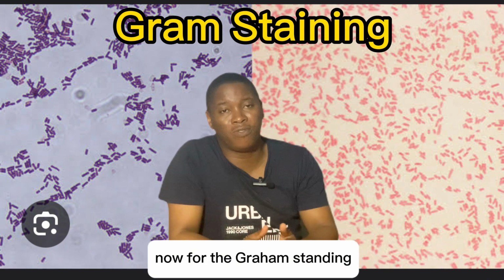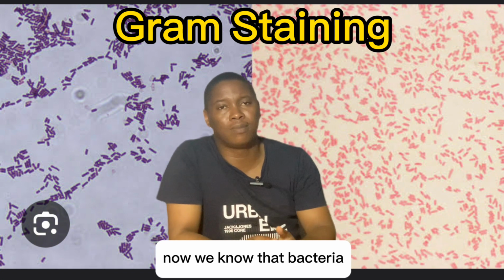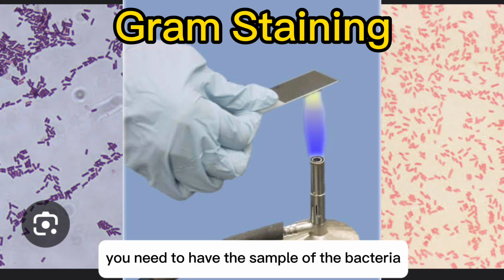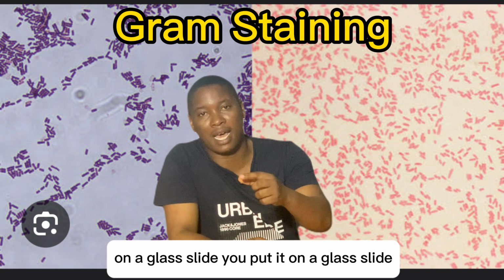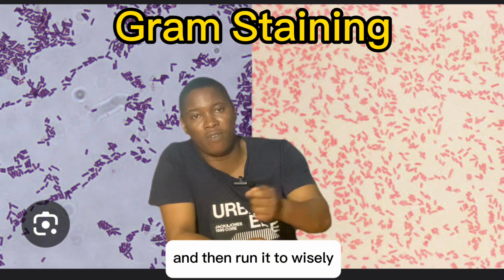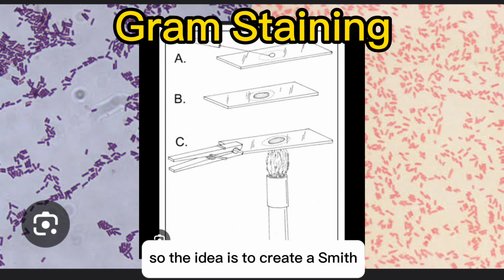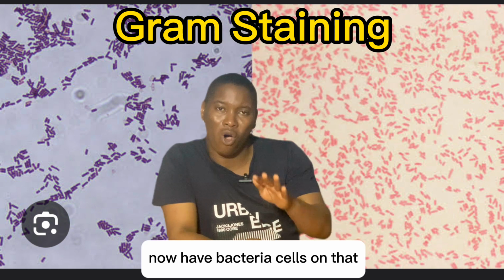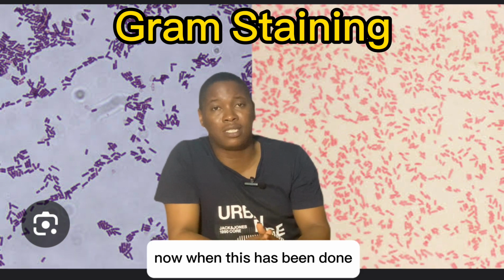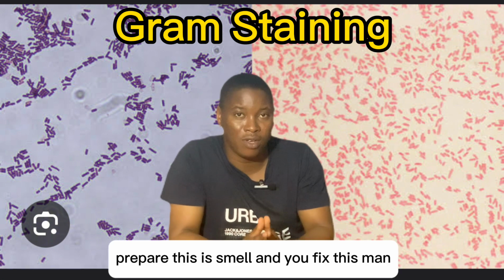For gram staining, the first thing you have to do is heat fix a smear. In order to gram stain bacteria, you need to put a sample of the bacteria on a glass slide. You can put a drop of water on the slide and run it over a flame very quickly, or you can leave it to air dry. The idea is to create a smear. You now have bacterial cells on the glass slide, dry and ready to go. That is what we call fixation. You prepared a smear and you fixed the smear.